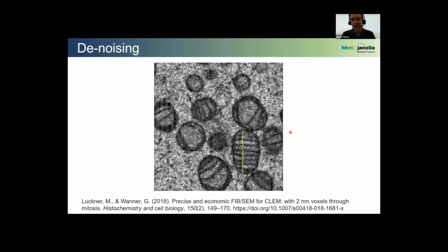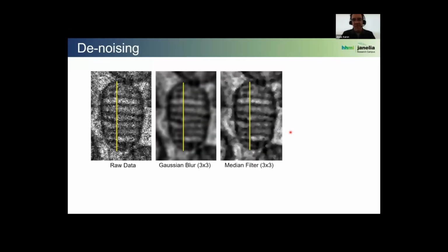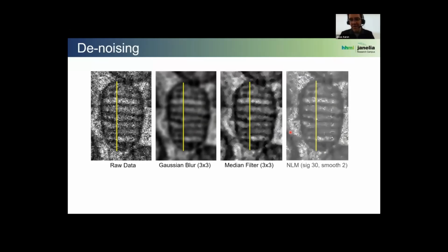And in the age of machine learning, I think this is becoming a problem that can be addressed fairly robustly using quantitative methods. Now, I know that probably most of us are at least somewhat familiar with ways to make the noise in your image appear less. There's three just common examples. They're not always very ideal, right?